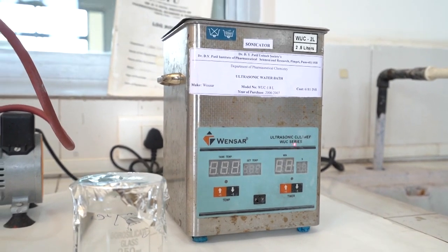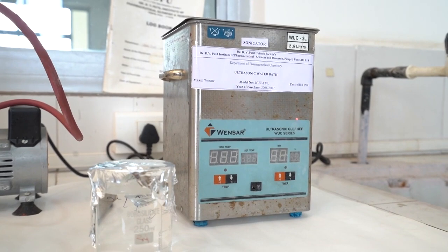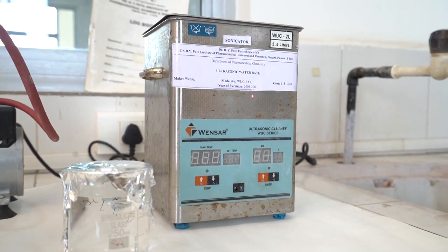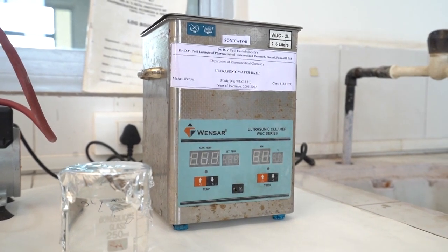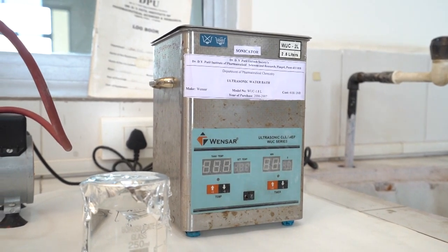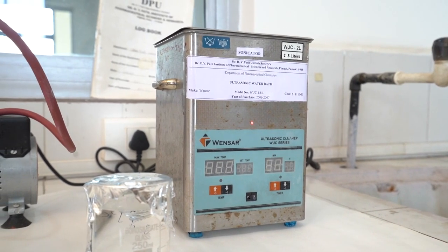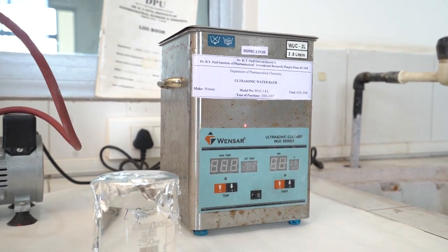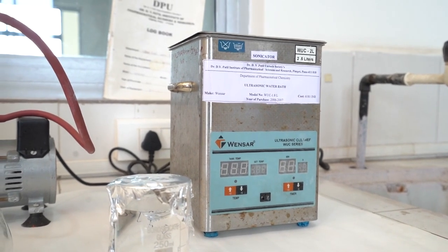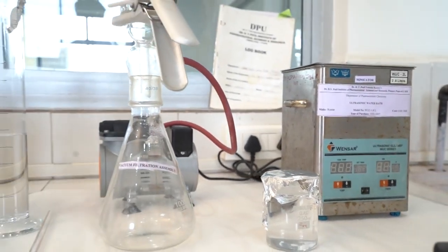Ultrasonication for longer periods is not recommended, as this can lead to an increase in the temperature of the system and may affect the stability of thermally unstable drugs. Ultrasonication is carried out to remove the air bubbles that may be present in the mobile phase. Otherwise, this can result in fluctuation of the pressure of the pump and can also affect the baseline of the detector. After ultrasonication, vacuum filtration is carried out.